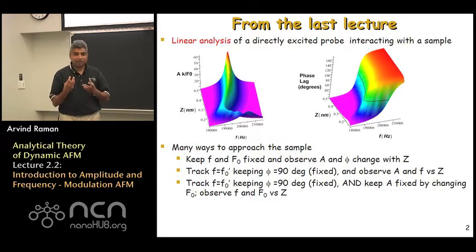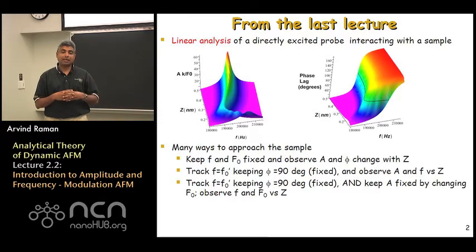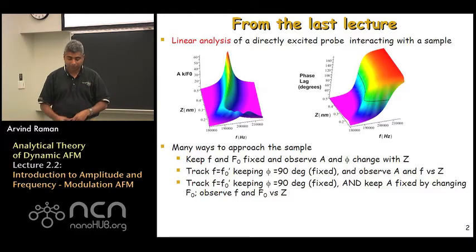So there are three different hypothetical ways of approaching the sample we talked about last time. And really what we'll do today is to see how that basic understanding forms the basis of common scanning methods in dynamic atomic force microscopy.